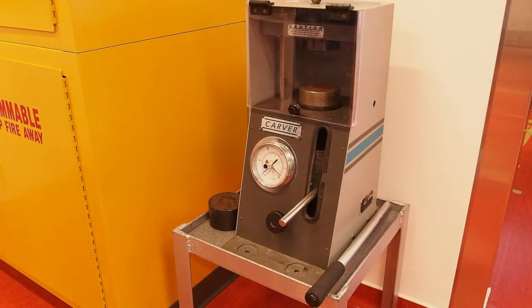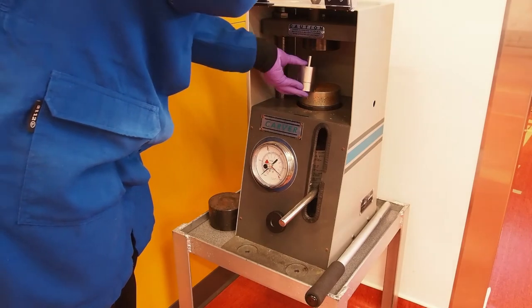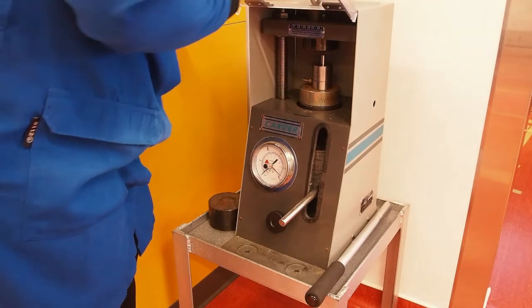Carefully transport the die assembly to the pellet press. Place the die into the press and ensure that the safety shield is locked.